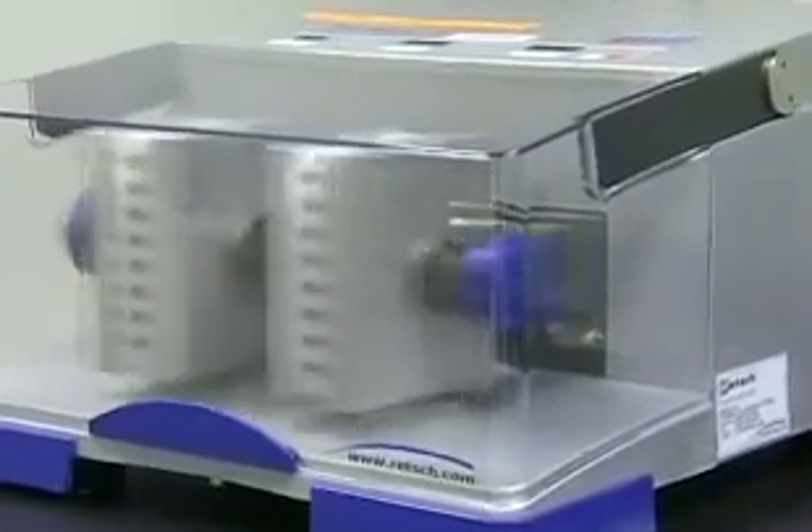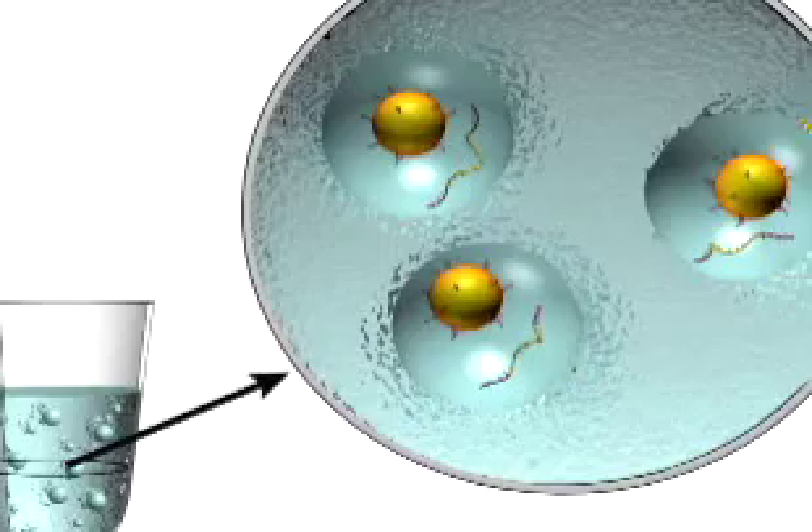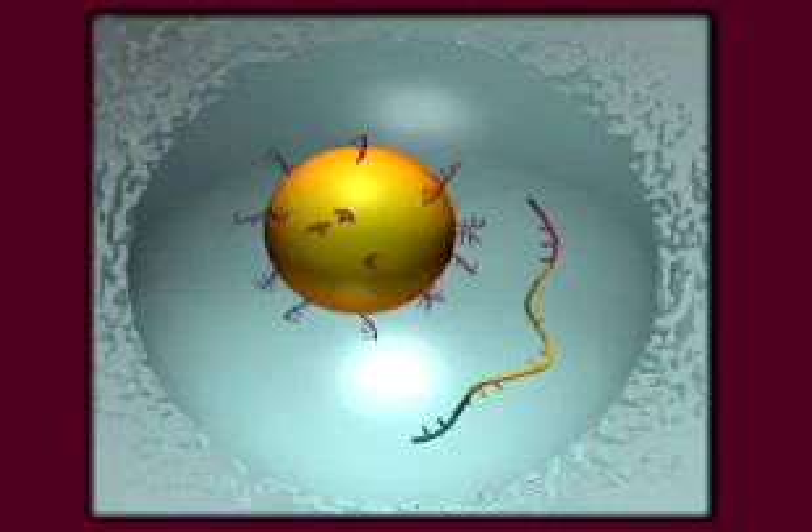When the tubes are vortexed, the beads are suspended in little drops of water containing PCR reaction mixture and a sea of oil. This is called an emulsion — just like salad dressing. We call the little droplets micro-reactors, and we want every droplet to contain a single piece of input DNA and a single bead.